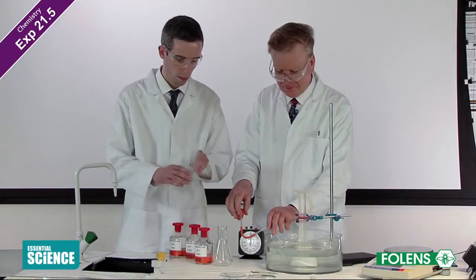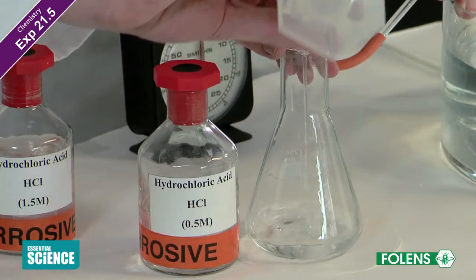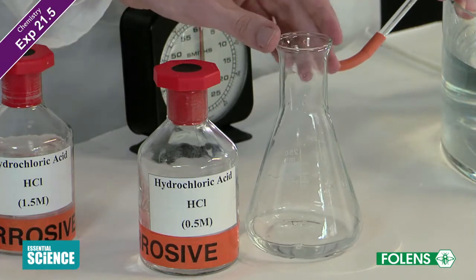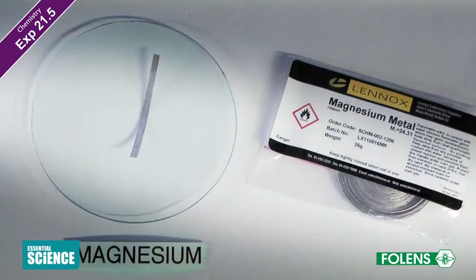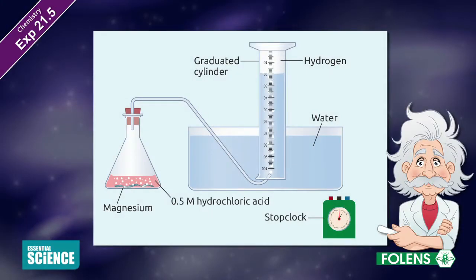Using a graduated cylinder, place 50 centimeters cubed of 0.5 molar hydrochloric acid in a conical flask. You will need about 6 centimeters of magnesium ribbon in this experiment. This has a mass of approximately 0.07 grams. Set up the apparatus as shown on the screen. Use a 100 centimeters cubed graduated cylinder to collect the hydrogen gas.